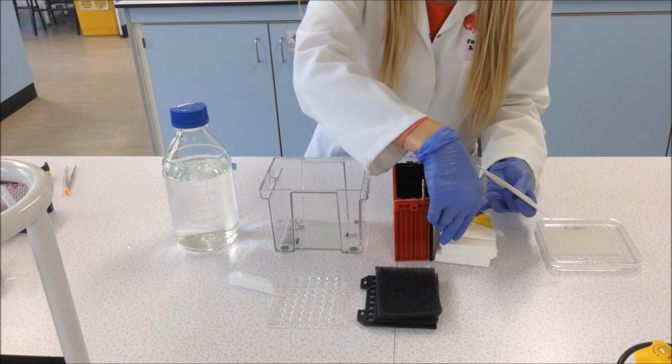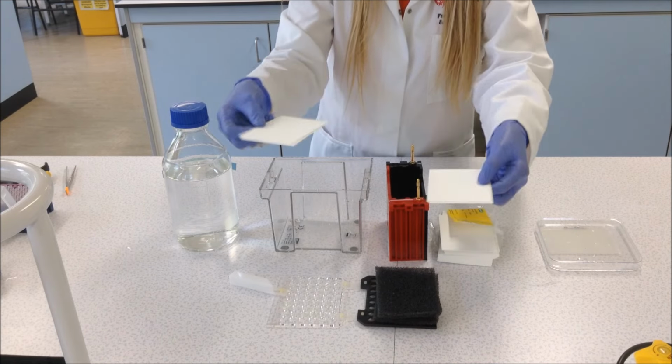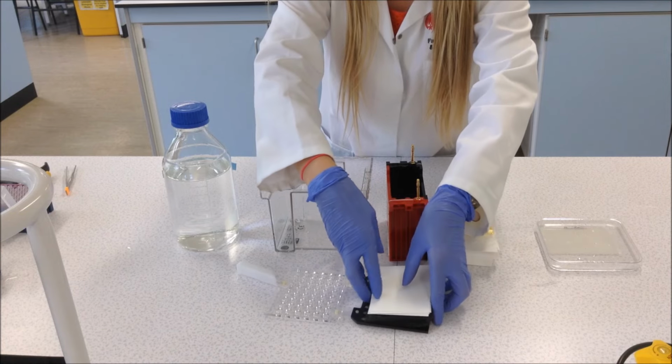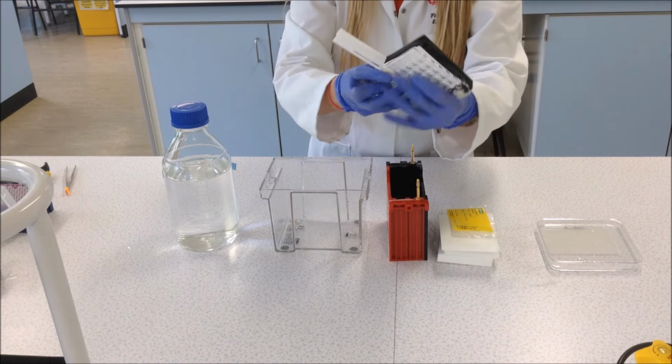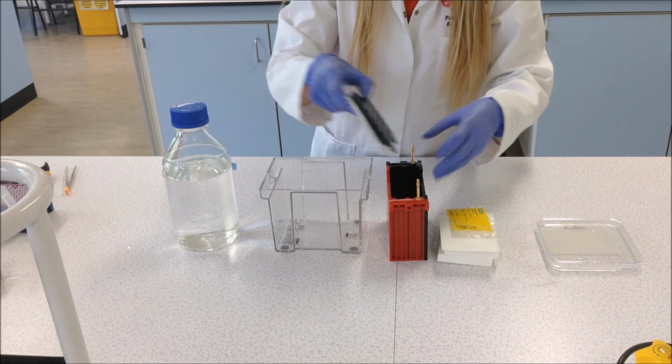Depending on the thickness of your blotting paper depends on how much you use. In this video, we are using two pieces above and below where we're going to sit the membrane. Then just to be tidy, you can fold up the cassette together and place it in the module.